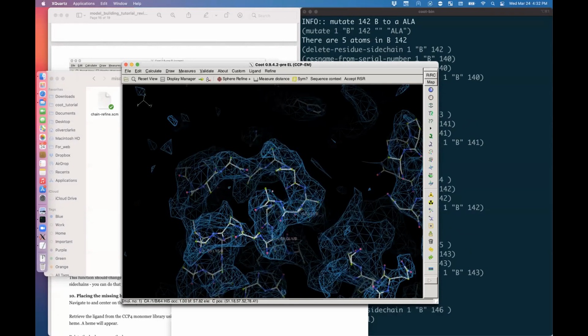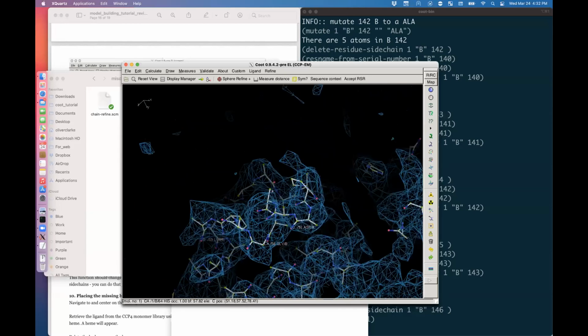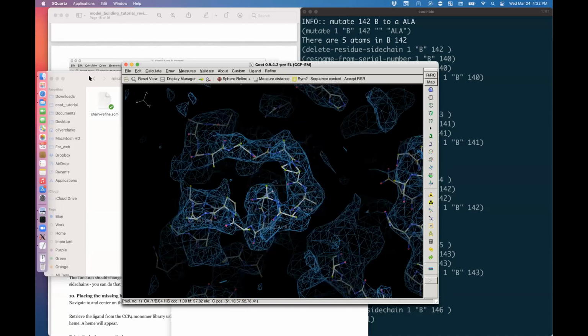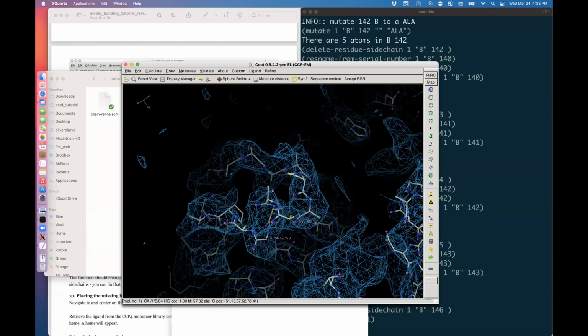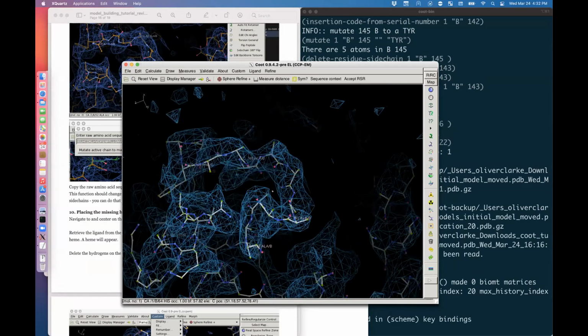So now we are done. And now if we wanted, we could go through and fix everything up, but we don't really need to do that right now.